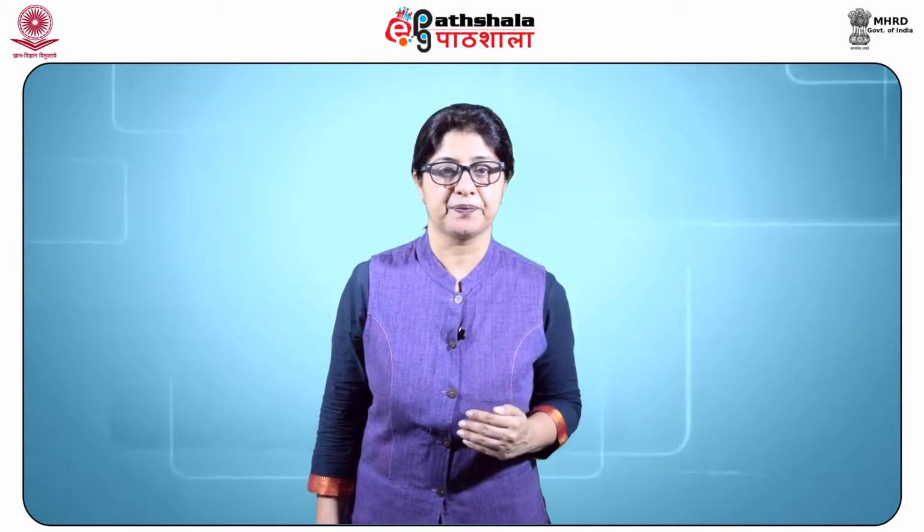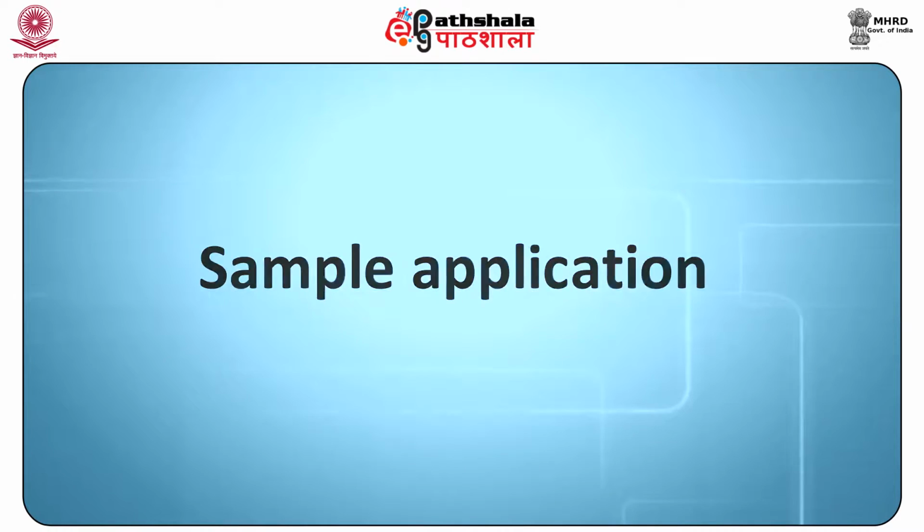Sample application. A glass microsyringe is generally used for transferring the sample solution to thin layers for quantitative work. However, the use of capillary tubes is preferred for the qualitative analysis. The solvent used for the sample solution should be volatile and as non-polar as possible.